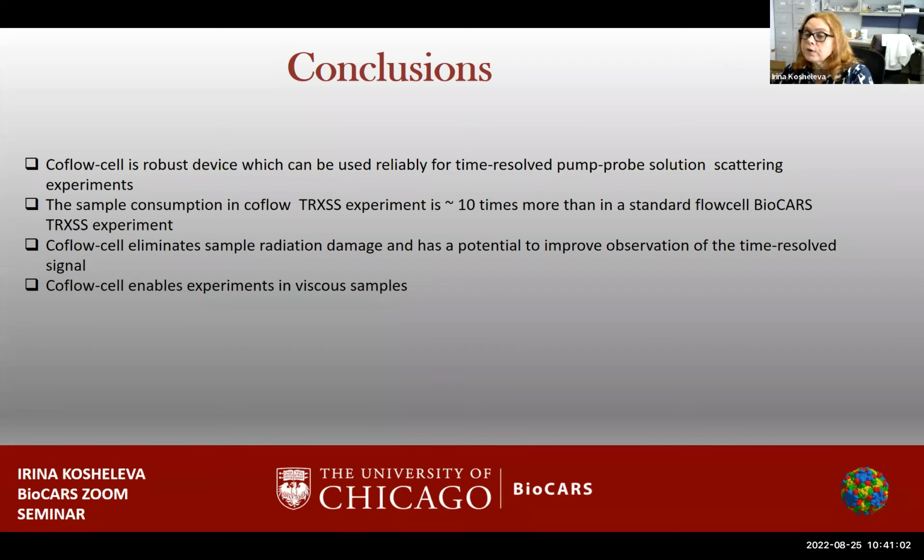Not exactly water. We are matching the outer buffer exactly with the sample solution. Therefore, because we do not want to change the pH and salt concentration of the inner stream, after the sample is measured, if the sample is reversible, it can be put through the concentrator and reconcentrated back. Therefore, I concentrated it for other commissioning tasks and measurements and stored it.